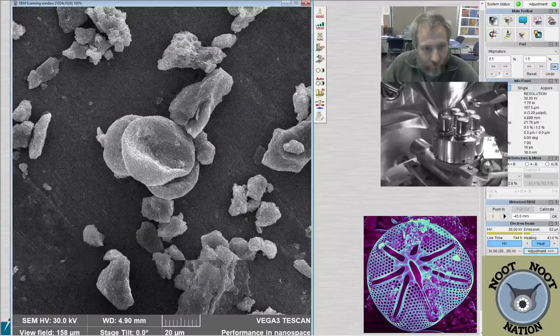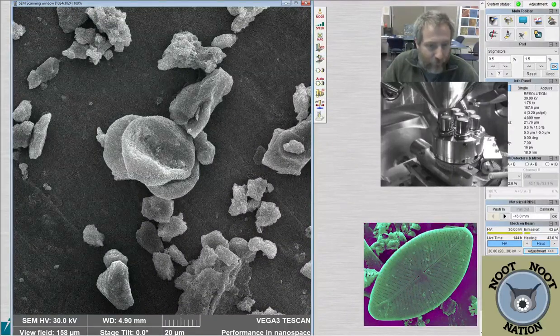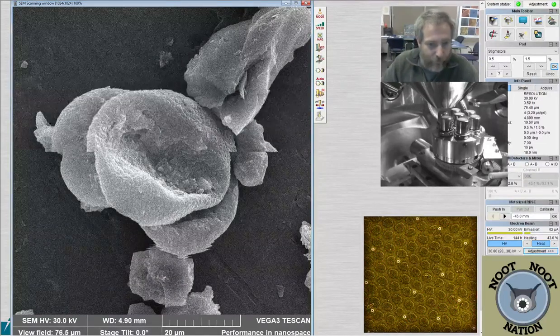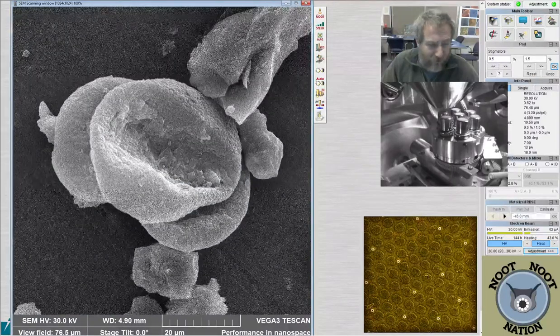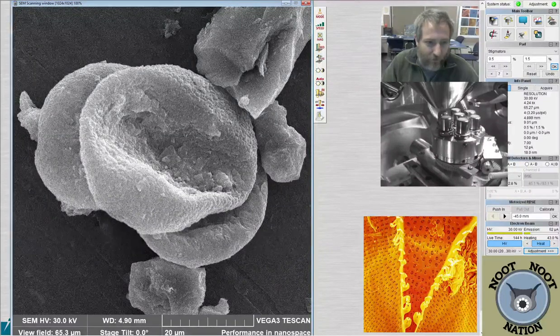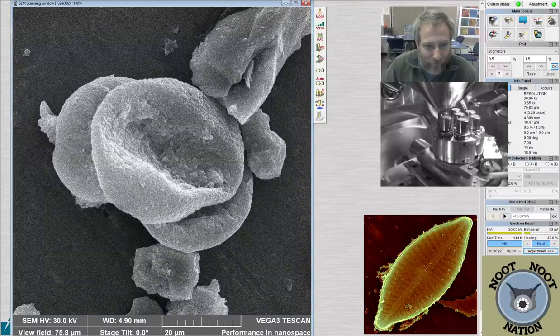So this little guy right here that we're seeing is not a diatom, but rather a pollen grain. And this is pine pollen. Pine are very common, and their pollen are super abundant in all kinds of aquatic systems. I don't typically analyze pollen, but we definitely see them on occasion, and I can recognize some of the genera. Pine pollen, people usually call Mickey Mouse because it has one central Mickey Mouse head and then the ears, basically. In this angle, it's not completely clear that it looks like Mickey Mouse, but I've seen it in the SEM enough before to know that that's a pine pollen.